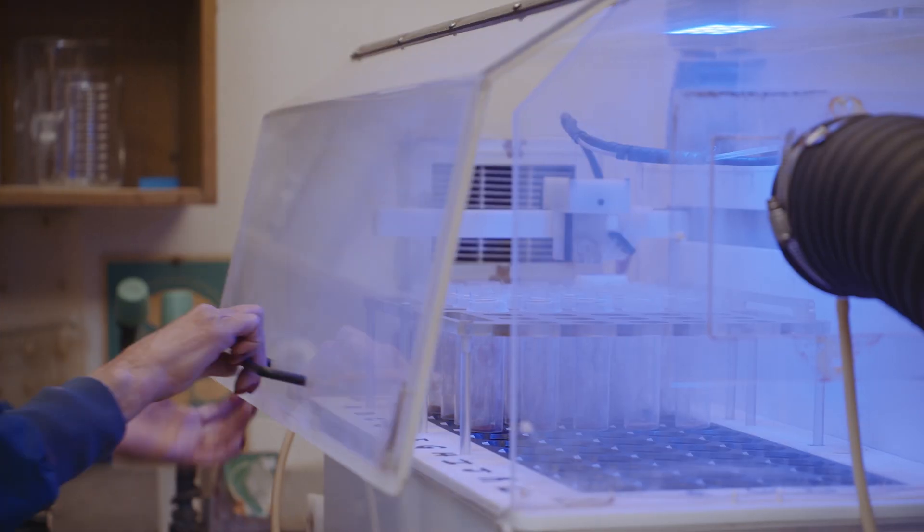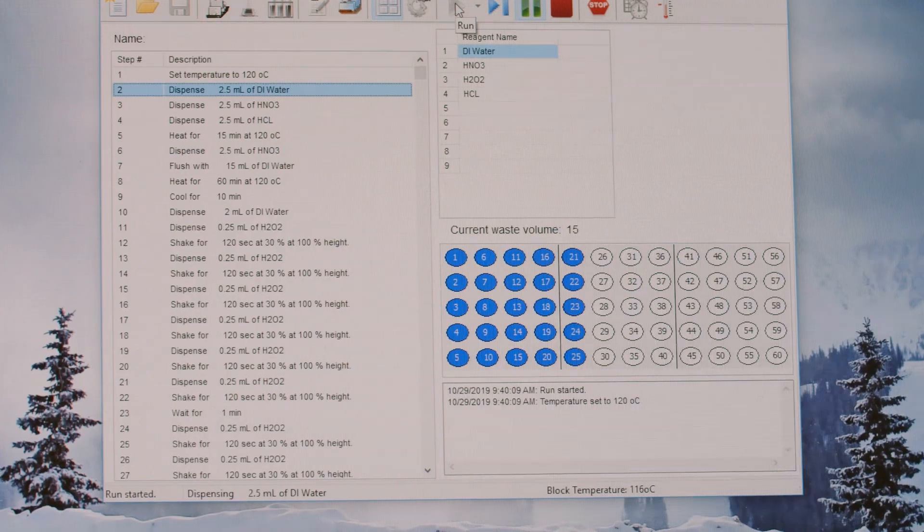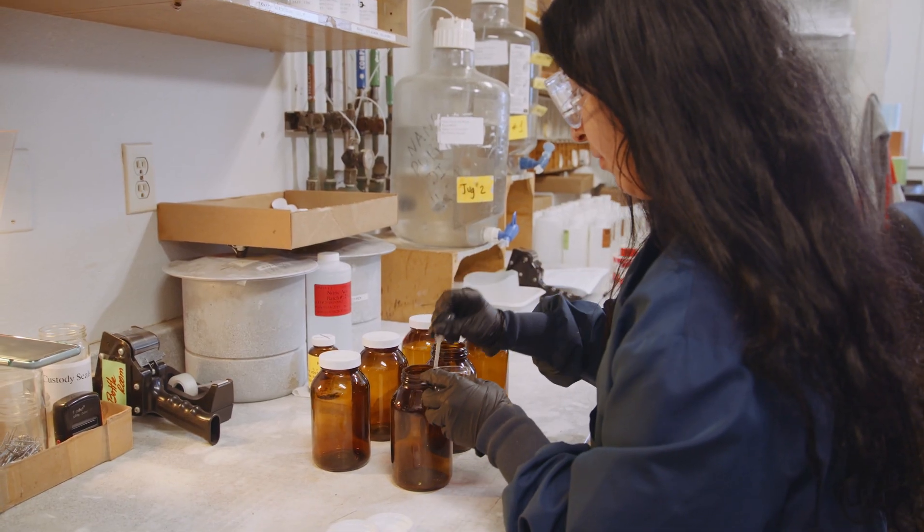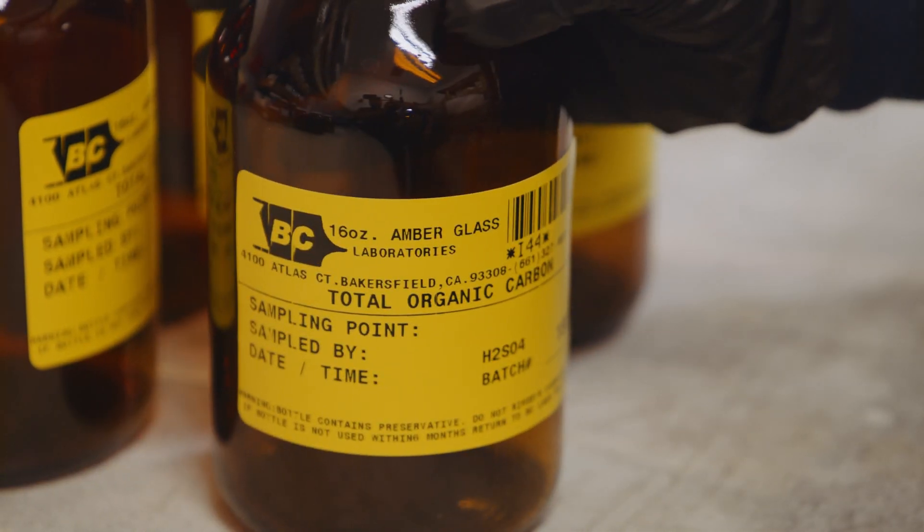At this time, they are also assigned to a friendly and knowledgeable project manager, who coordinates our lab resources. All samples receive a unique sample ID number, which follows each sample through the entire laboratory process.